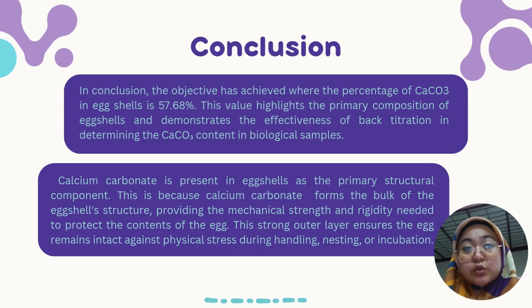Now we move to conclusion. In conclusion, the objective has been achieved, with the percentage of CaCO3 in eggshells being 57.68%. This value highlights the primary composition of eggshell and demonstrates the effectiveness of back titration in determining the CaCO3 content in biological samples.